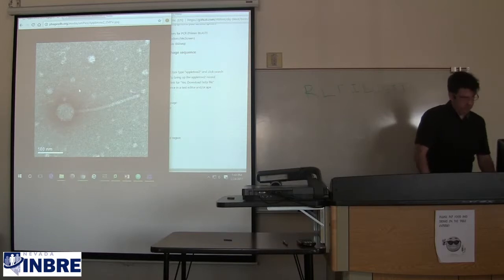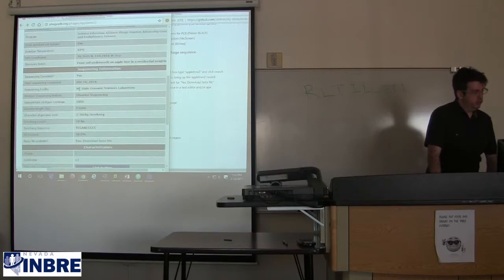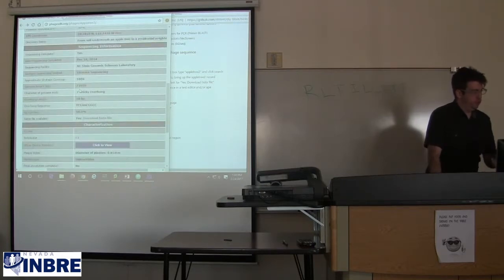Cool. And I didn't follow my own advice. I didn't right click, so I'm gonna have to go back. All right, so from this table of PhagesDB, we can see that this is in the process of being annotated. Perhaps you may be working with this this year, or other sequences. We're doing Nicole Terra this year. Okay. We probably could have worked with that as well, but I didn't know who its relatives were. So yeah, this is good.